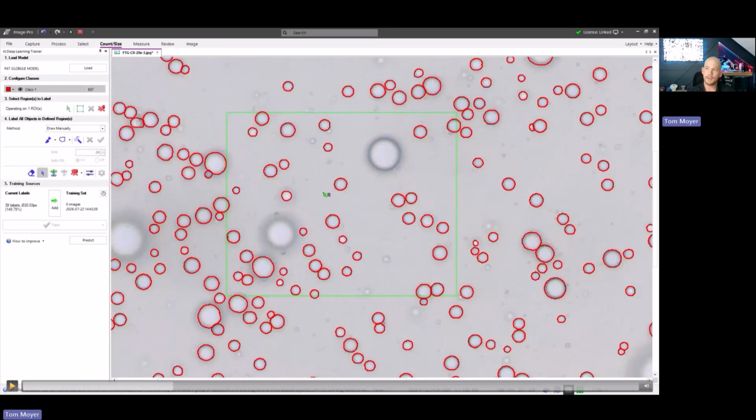A lot of the time, it just takes a single image, and not even the entire image, but just a small space within a region of interest. I just go ahead and label things correctly within that small square. I go ahead and train the model, and now I have something that is extremely accurate. Now, you could have to go back and give it some additional training by adding more reference labels, but I found that with most applications, you will see a vast improvement just using this small, tiny region within the image for training.